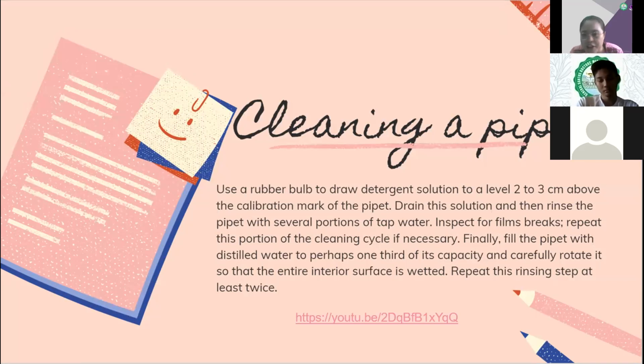So video muna tayo ngayon. Now, always remember, how do you know that the pipette is dirty? Lagyan mo siya ng water. And then pag ang water nag-form ng films inside, just like the video kanina, it means your pipette is dirty. So you have to rinse it hanggang na hindi na mag-break yung films ng water inside.